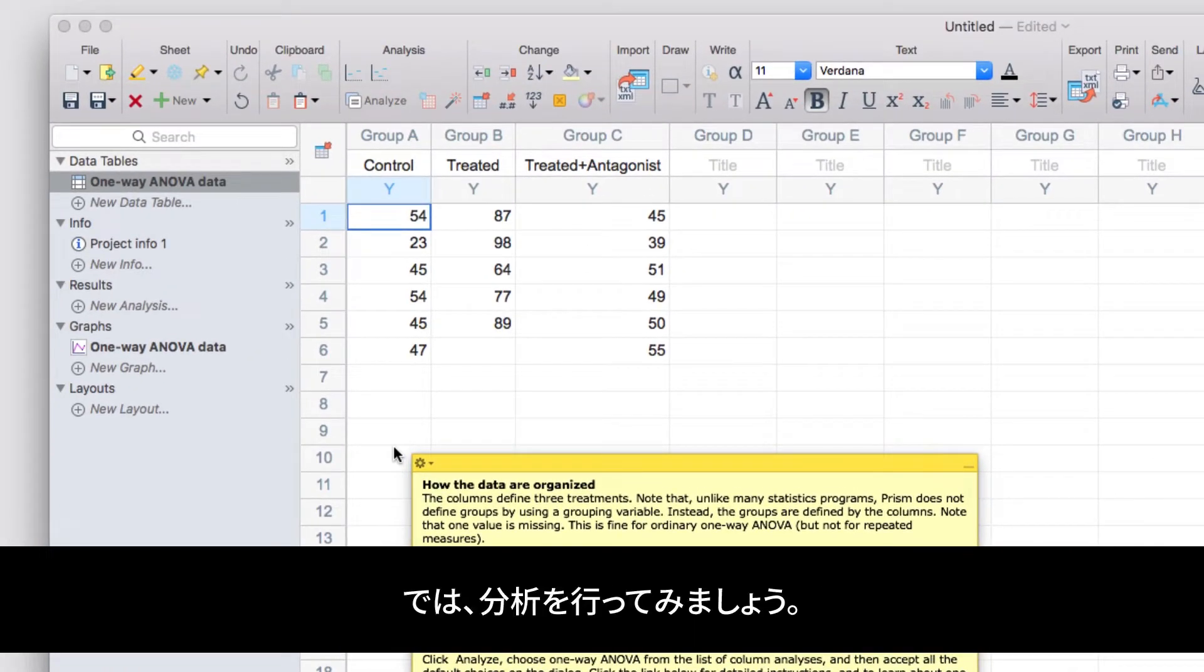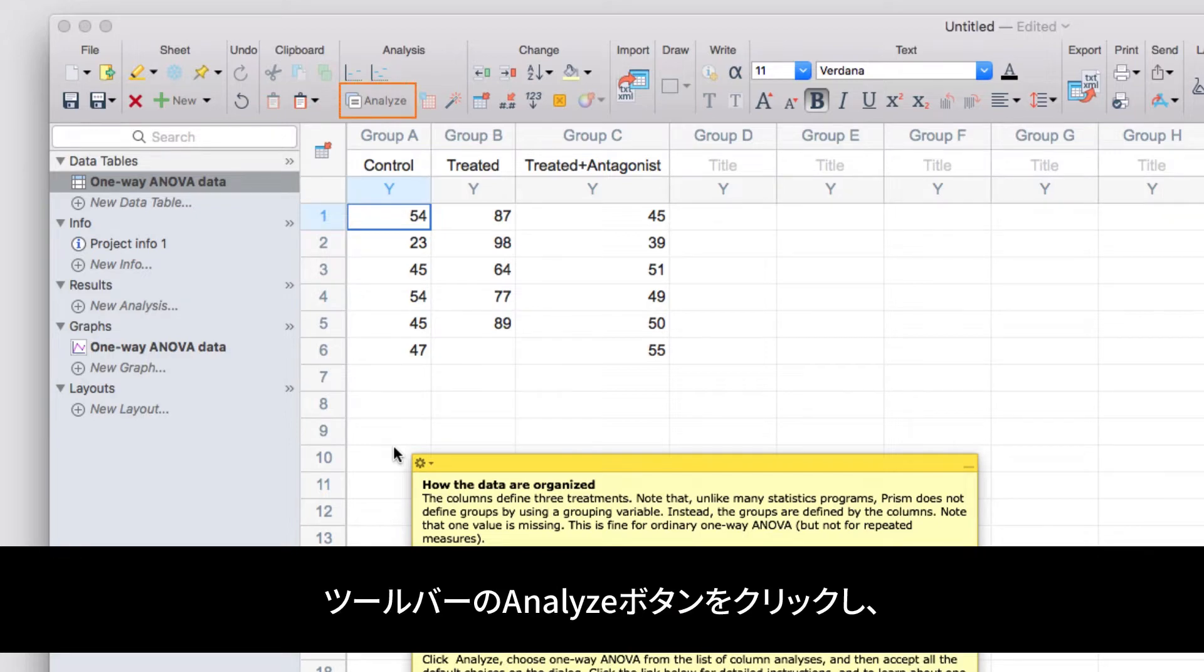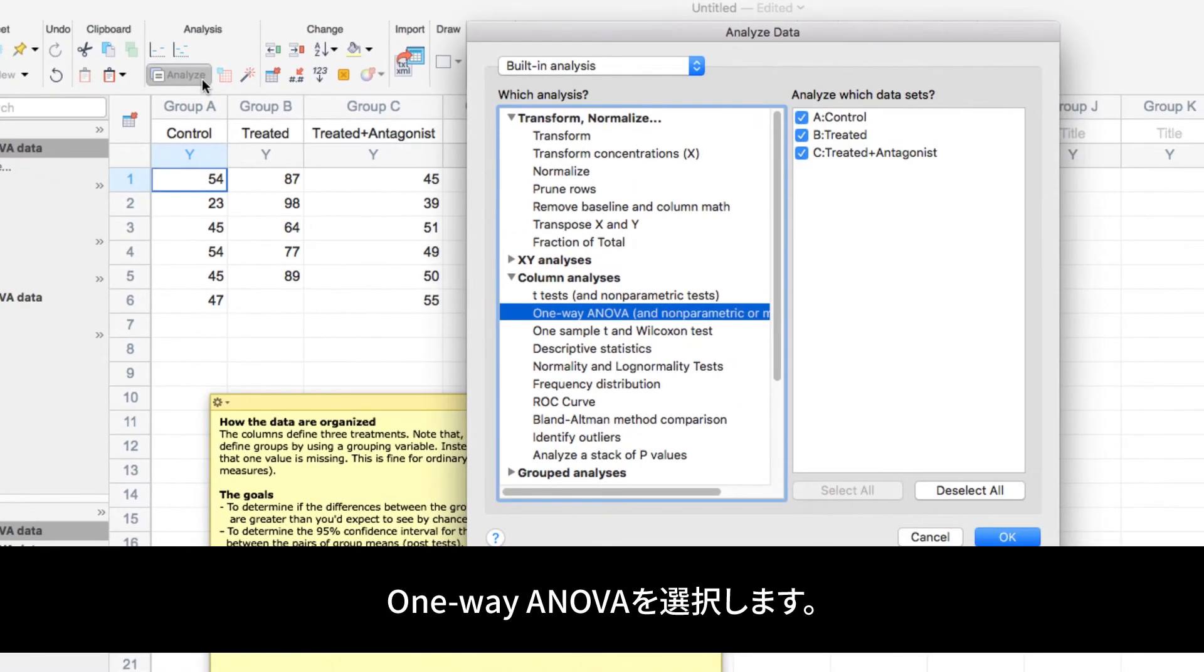Let's now look at how to perform an analysis. In the toolbar, let's click the Analyze button, select One Way ANOVA, and click OK.